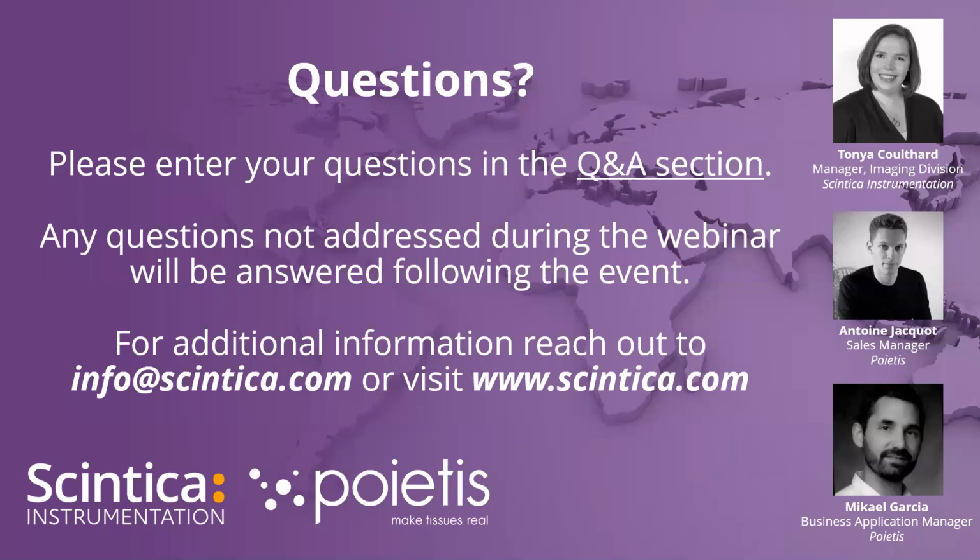Got it. Staying on the idea of temperature, with the integrated robotic arm, is there any heat generated during the fabrication process from that arm moving and doing all of the different steps? And would that affect the temperature of the environment within the system? Absolutely not. Yeah, so no problem at all with the robotic arm. Yeah. Perfect. Excellent.